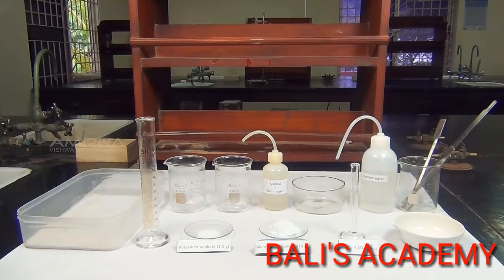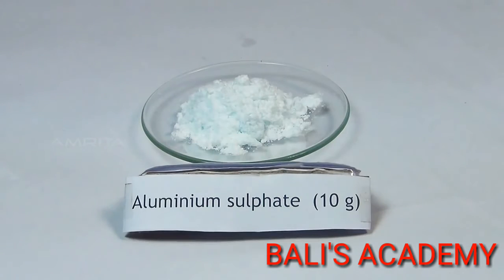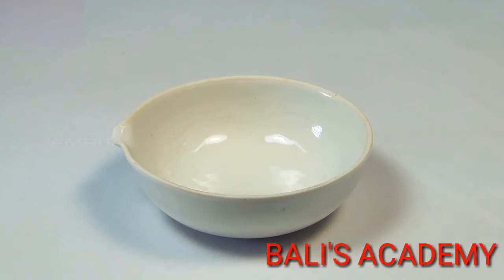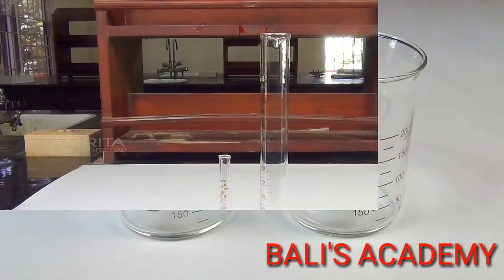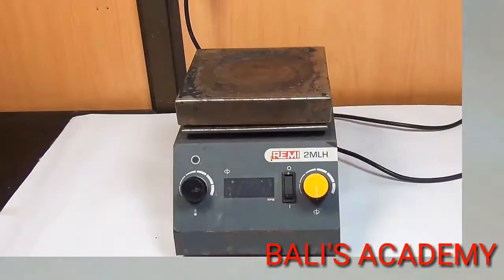Our aim here is to prepare a pure sample of potash alum. Materials required: 2.5g potassium sulphate, 10g aluminium sulphate, dilute sulphuric acid, alcohol-cold water mixture, distilled water, cold water, china dish, spatula, glass rod, beakers, measuring jars, crystallizing dish, watch glass, filter papers, and hot plate.